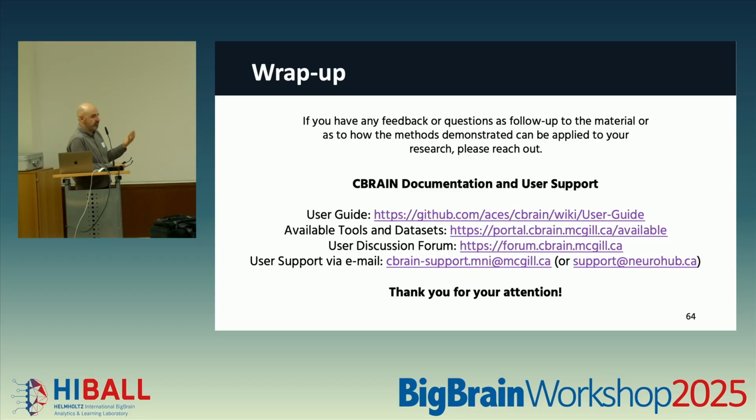And then, certainly there are going to be questions that come up, or things that you're not sure of, or you want to ask something. We have different ways of reaching us. One, we have a built-in user discussion forum, so you can see what other people have asked before. If people have asked about running or downloading things, those are there. Obviously, it helps build that sense of community information sharing. That's through our discussion forum.